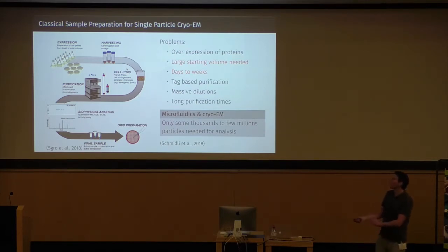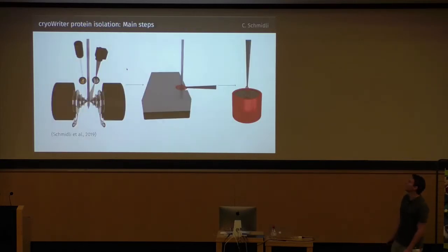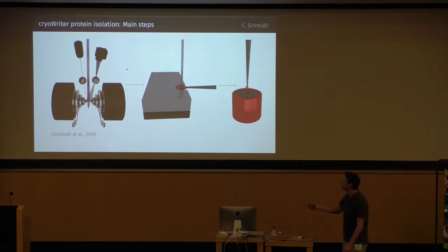So we tried to integrate this into our system as well, and we did this by installing an electromagnetic trap in the system. It actually consists of two electromagnets with two cooled iron tips, a camera for monitoring what is going on, and a UV LED for photocleaving the crosslinker, so for photoelution of the protein in the end. And the capillary is indicated here in between those two tips.